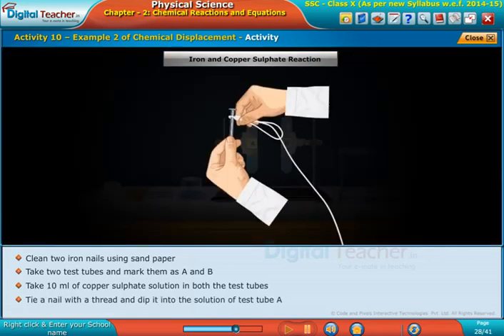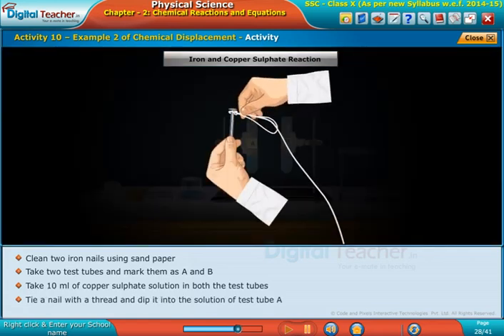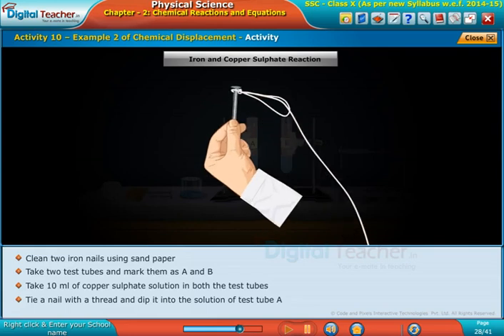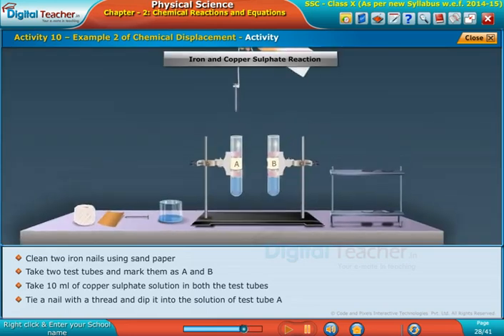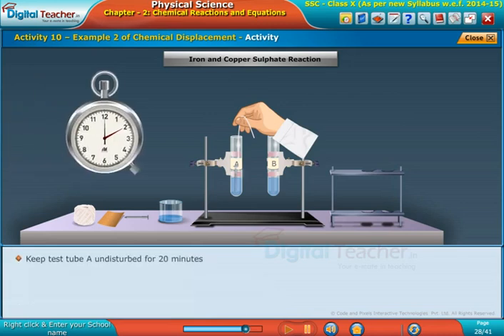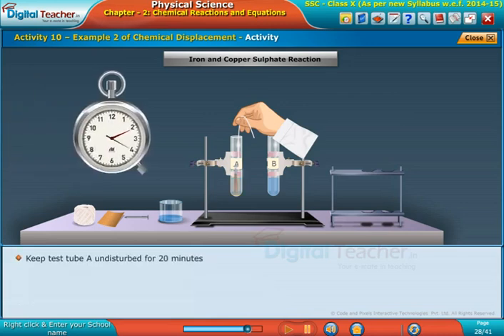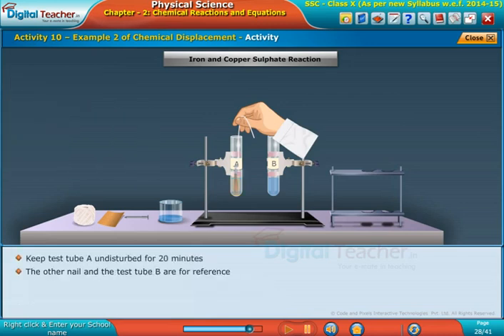Tie a nail with a thread and dip it into the solution of test tube A. Keep test tube A undisturbed for 20 minutes. The other nail and the test tube B are for reference.